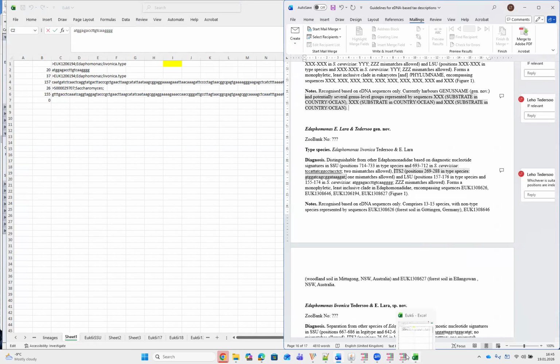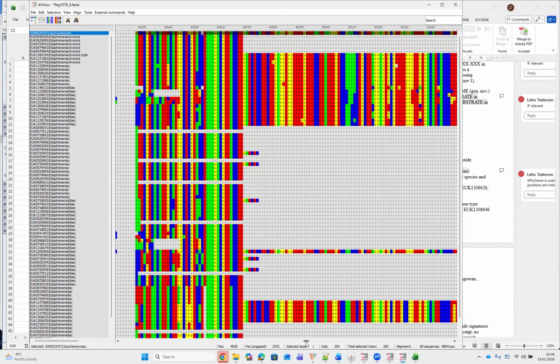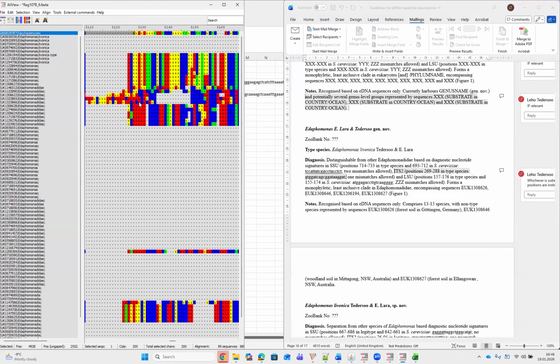We had plenty of distinguishing nucleotides, so let's define these too. So certainly it will be the 3rd, 7th, 11th, 12th.